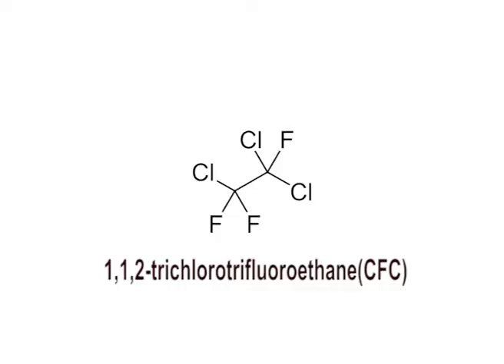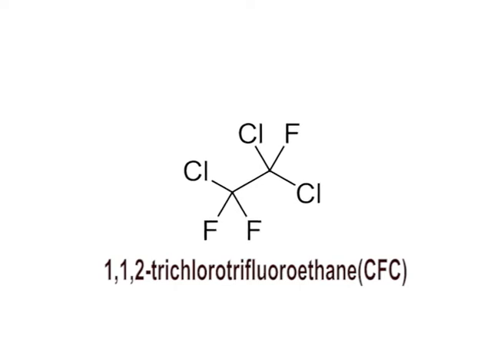Next is regarding the methodology. The exhibit on which latent fingerprints need to be developed is dipped in the DFO solution. The solvent of choice for preparing the reagent is 1,1,2-trichlorotrifluoroethane, abbreviated as CFC-113, but generally known by its common name Freon.